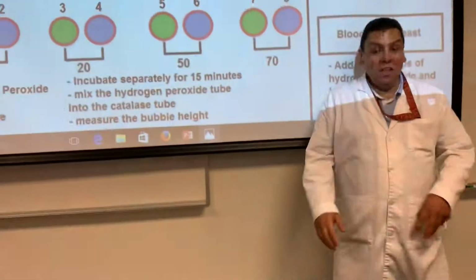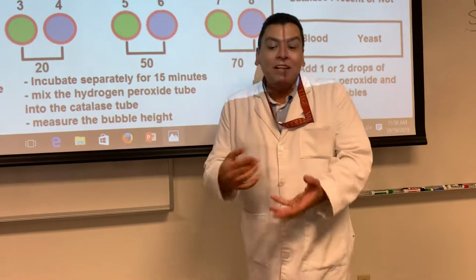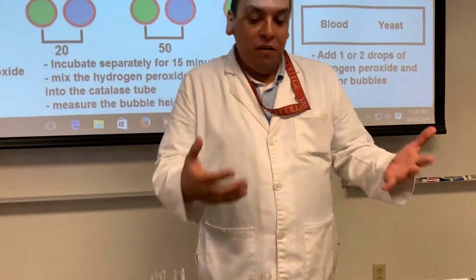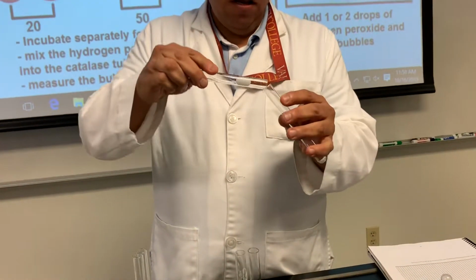Okay, what is your prediction for 50? Will it be more than this or less than this? It'll be less. You know why? Because it's on its way to denaturing. It's 50 degrees. It's on its way to denaturing. Let's see.